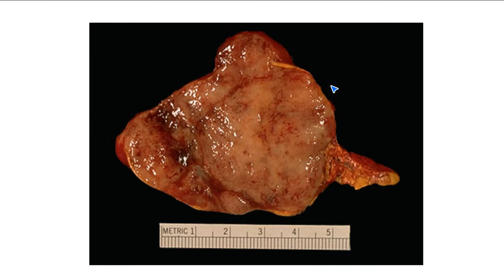Cortex or medulla? So the cortex, okay, so the cortex shows this bright yellow color, fabulous. And remember, that is what we see on the outside. So this is the cut surface, right? So we still have bits of cortex here on the outside.